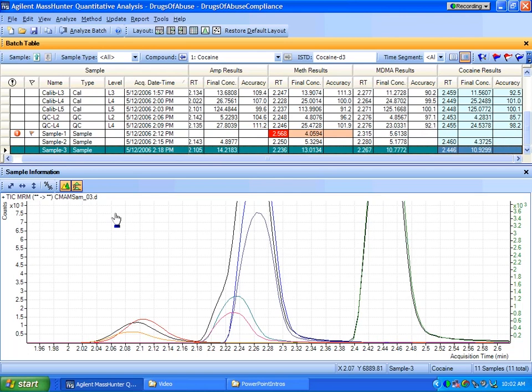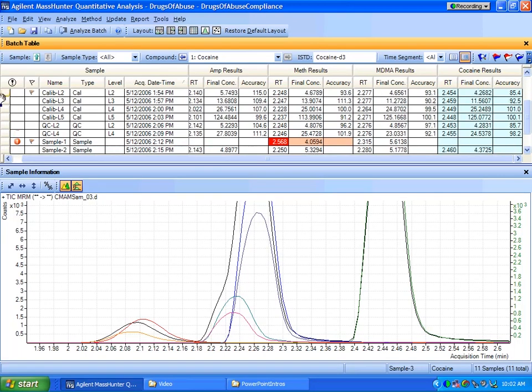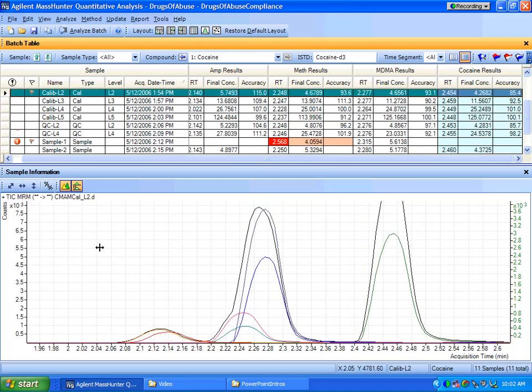So that will give me a visual check that matches my expectations of what I would expect to see in this batch from the point of view of looking at a sample at a time. And let me add in a technical explanation that as I move between each of these samples, I will actually extract that chromatogram dynamically. So I'm actually moving sample by sample. Once I've visited that sample, of course, those extracted chromatograms are remembered, or use the term cached.